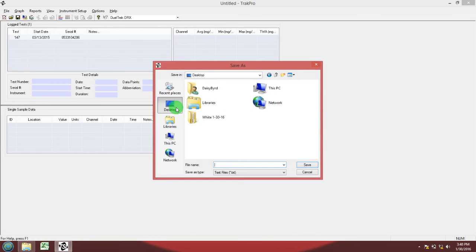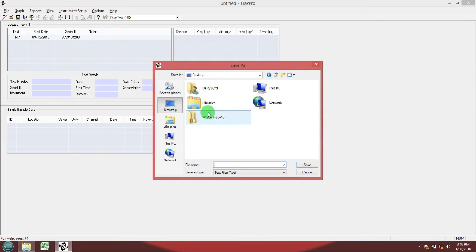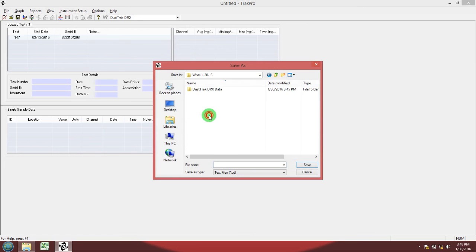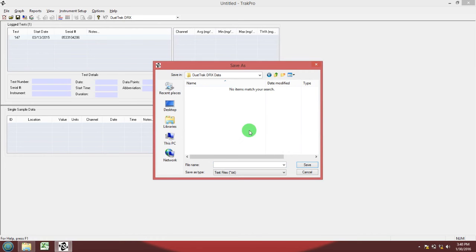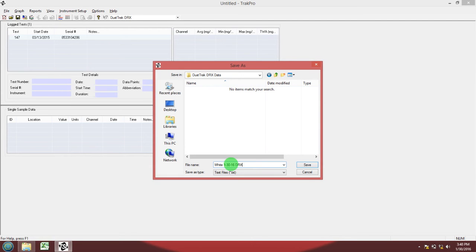Go to the desktop, find your folder. Go inside the DustTrack DRX data folder. Name your device, your last name, the date, and DRX so that you know that this is DRX data.